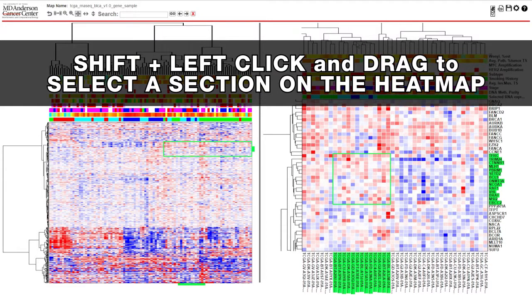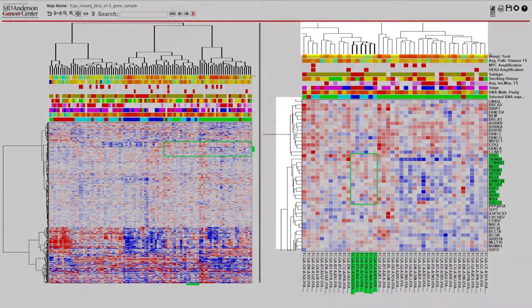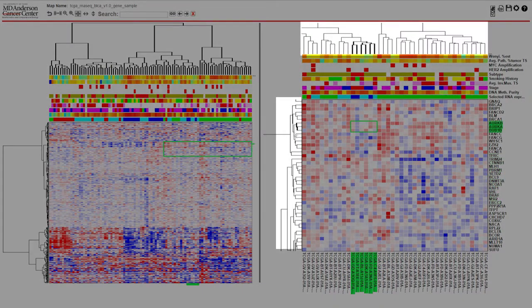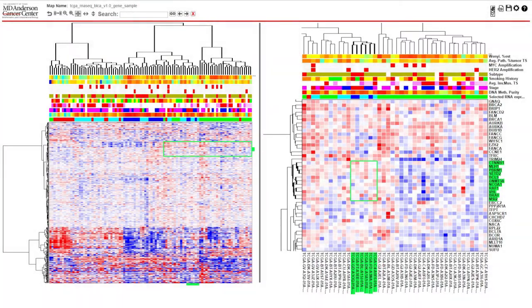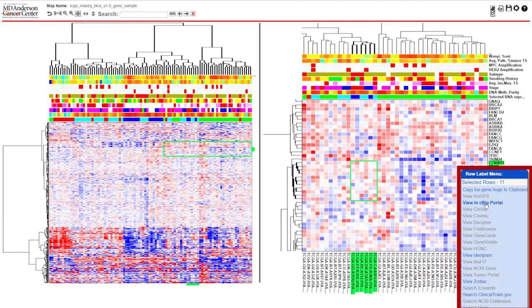You also have the ability to use the dendrogram columns or rows by clicking on the hierarchy there. With a group selected, operations like link outs can be performed on those rows, columns, or matrices. Right-click on the label name to get the link out option box to appear, then left-click on which tool you would like to view the selection with.